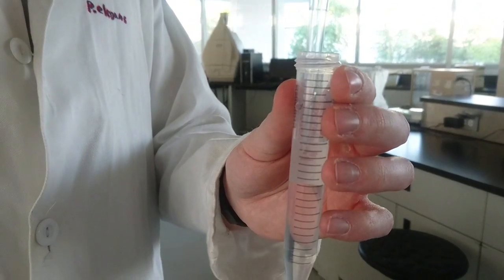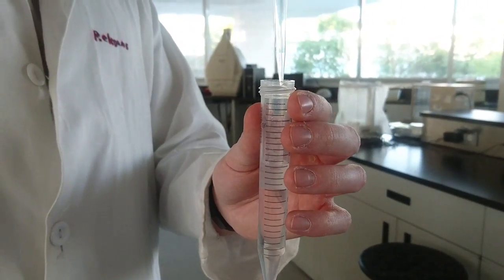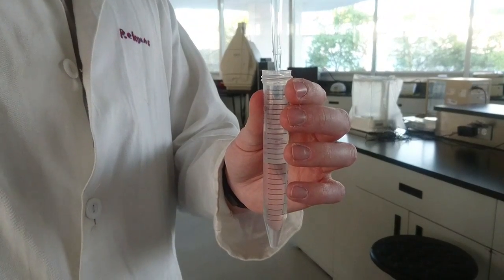Now, these errors can be reduced with good lab practices and pipette practices. For instance, only submerging the tip of the pipette in the liquid and doing the whole motion in one continuous and slow pipetting motion. The mean indicates the exactitude of the calibration process or the pipetting. The deviation of the mean from the expected value may be attributed to errors in the calibration or errors in the volume adjusting process by the student. Finally, as a tip, when you stop using the pipette, you should set it to its maximum capacity so it can last longer.